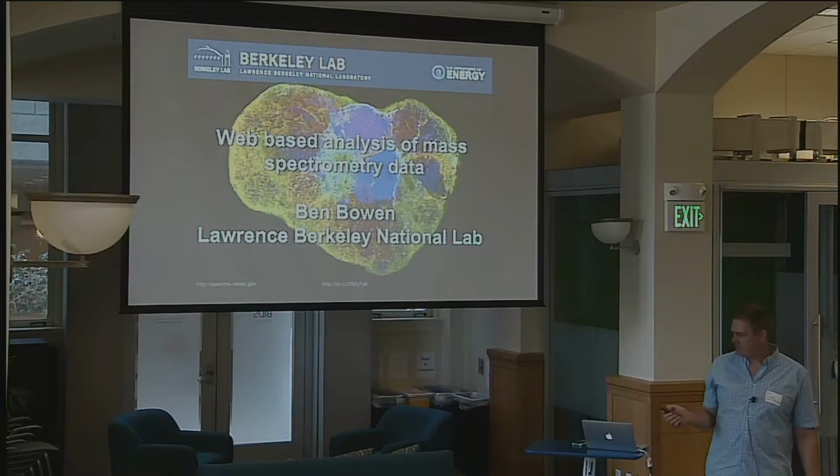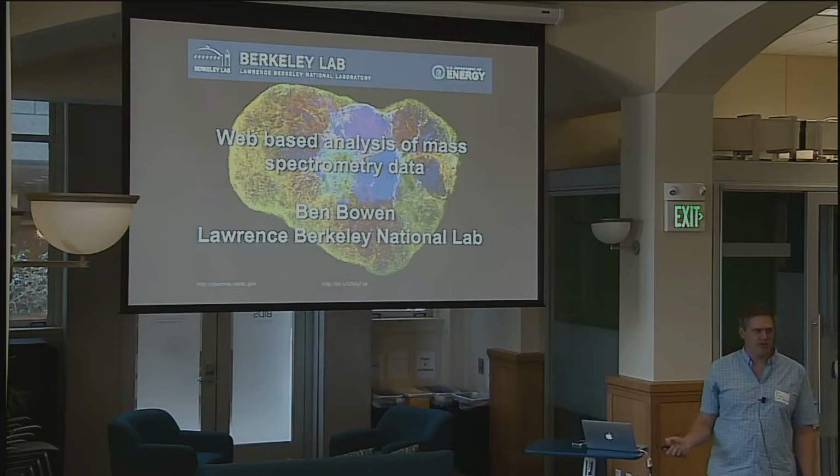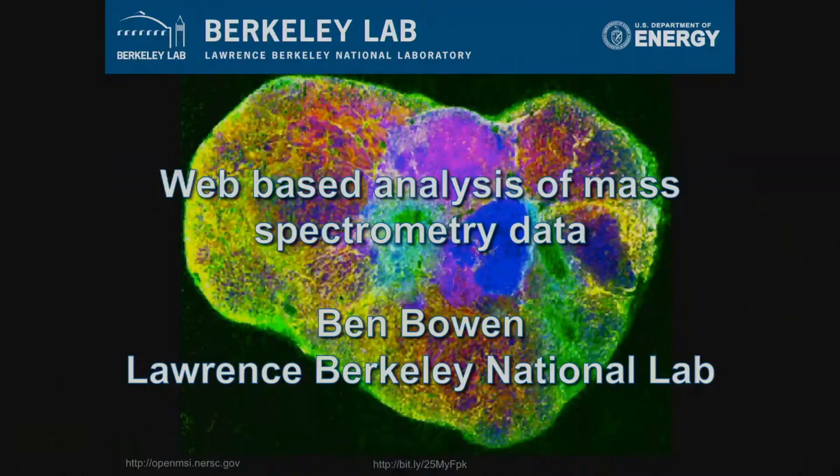But instead of this image only having 3 colors, it has about 1 million colors behind it. And I'm only showing 3 slices. So although the spatial resolution of this image may be considered poor compared to an iPhone or something, the chemical depth of information you get from a mass spectrometry image is many, many orders of magnitude greater than what most photonic techniques do. So we call this hyperspectral imaging, and we'll talk a bit about it today.